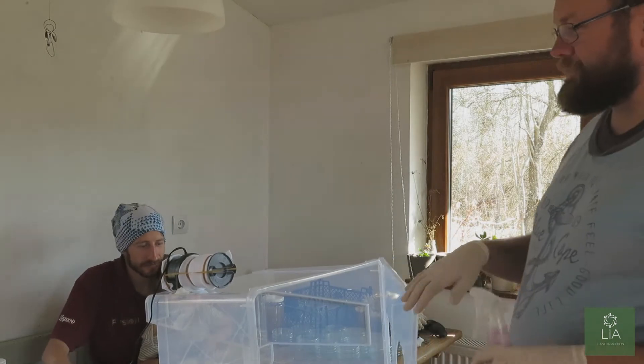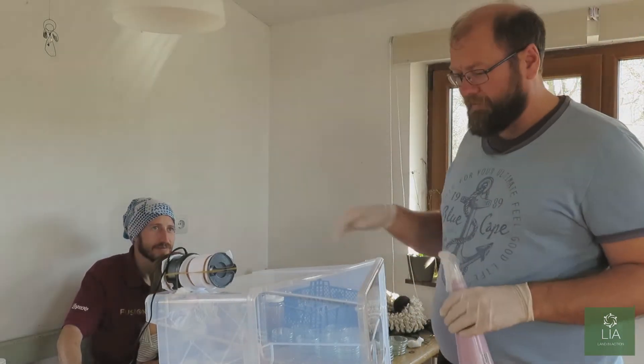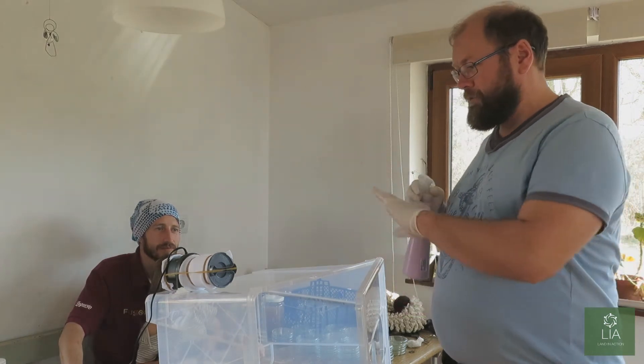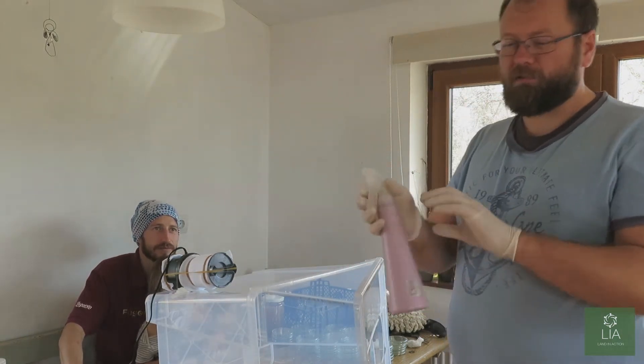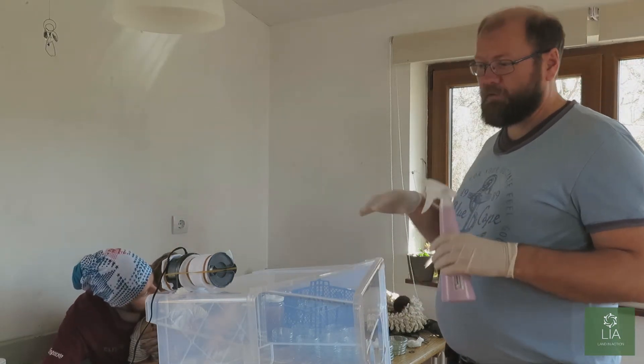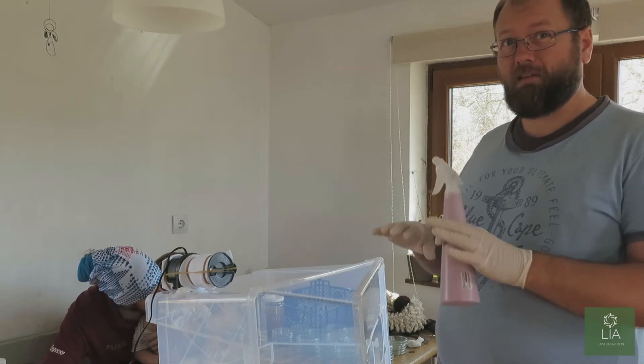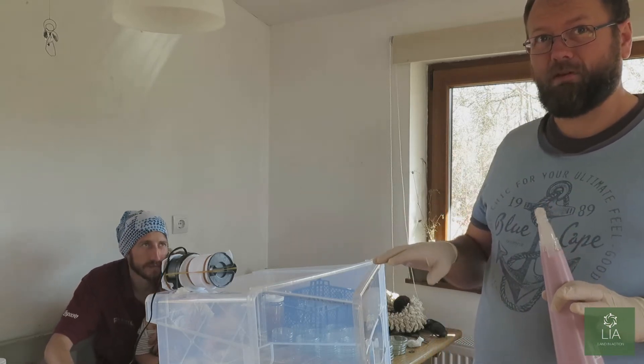So before we get started pouring the agar into the Petri dishes, we're going to clean the area. We're going to spray everything with alcohol, wipe everything down — arms, gloves. And then before we transport the dishes in, we will clean all the dishes before putting them into the environment, so everything is absolutely clean.